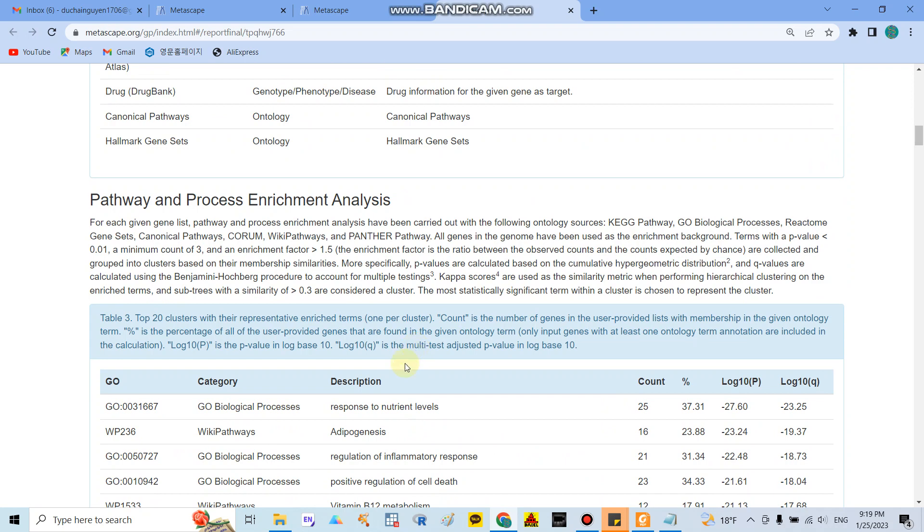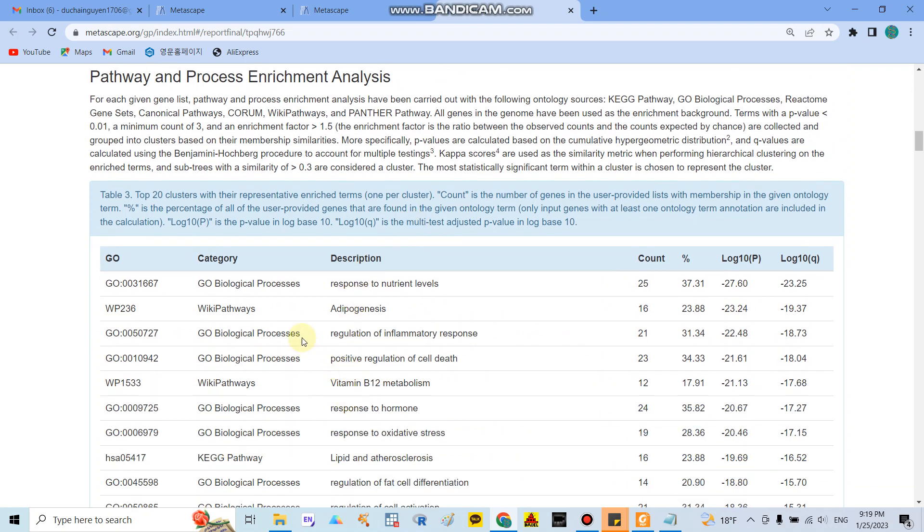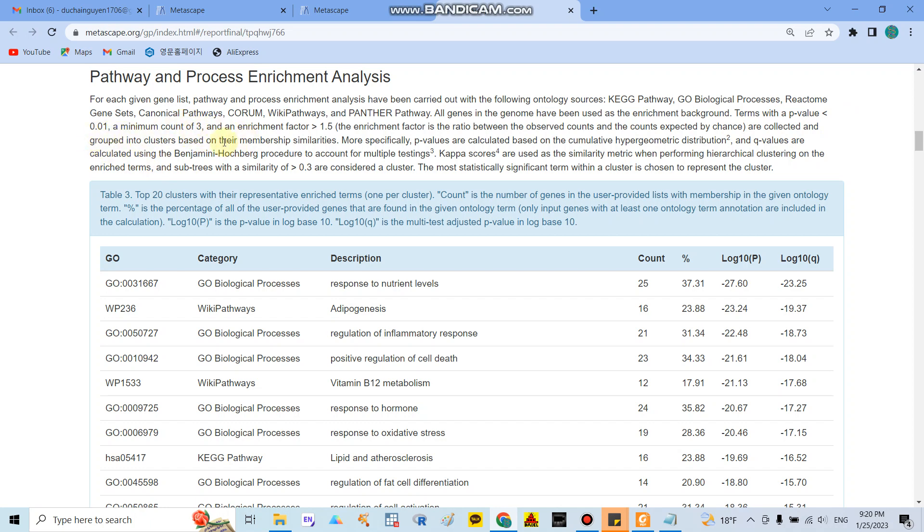And I mentioned a bit about how they analyze and they can solve the data. In here if you enter the gene to the software, after that they will analyze with a lot of sources. You can see here they will use the KEGG pathway, GO biological processes, Reactome gene sets, canonical pathway, WikiPathway, Panther pathway, some kind of thing like that. The term of p-value is less than 0.01 and minimum count of three and enrichment factor more than 1.5.